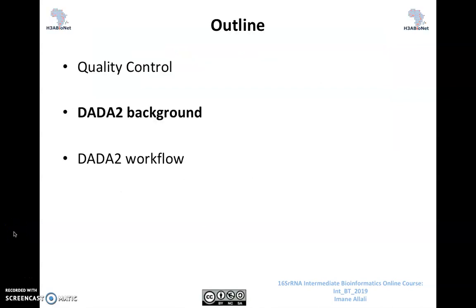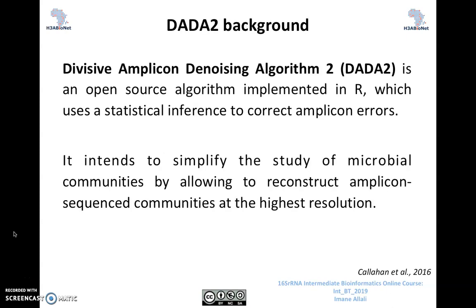In this video, I'm going to be talking to you about DADA2 background. DADA2 stands for Divisive Amplicon Denoising Algorithm. It is an open source algorithm implemented in R which uses statistical inference to correct amplicon errors.